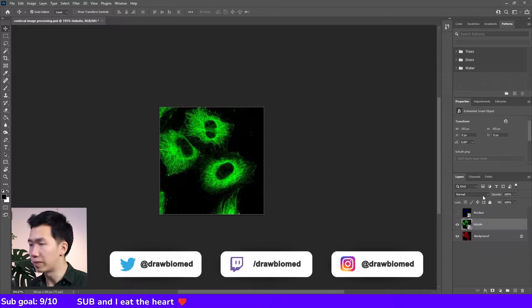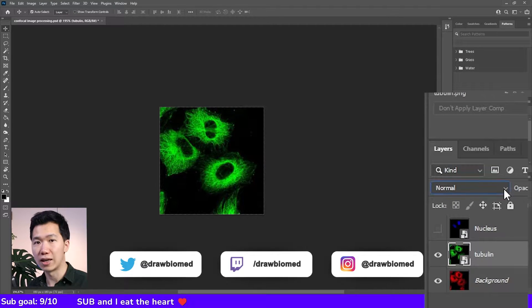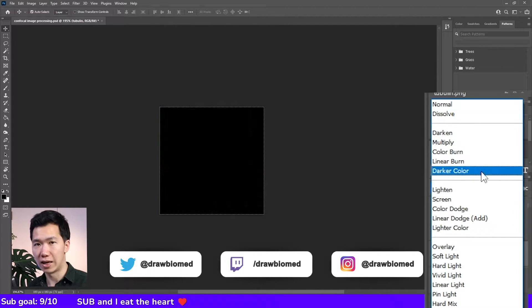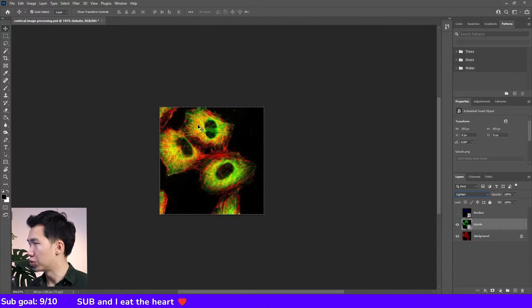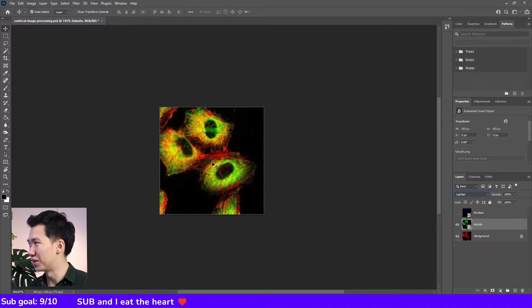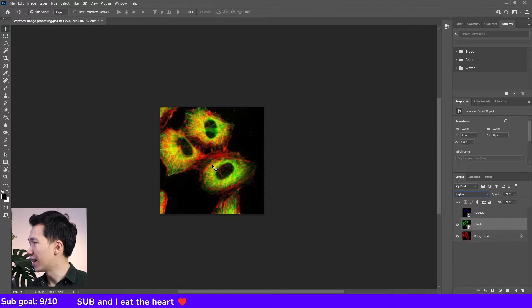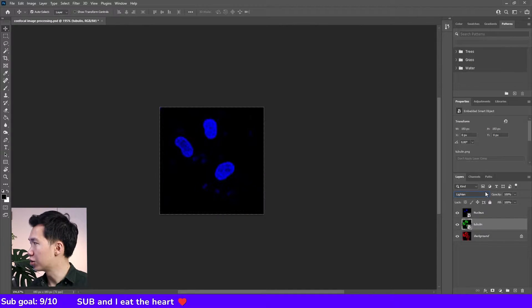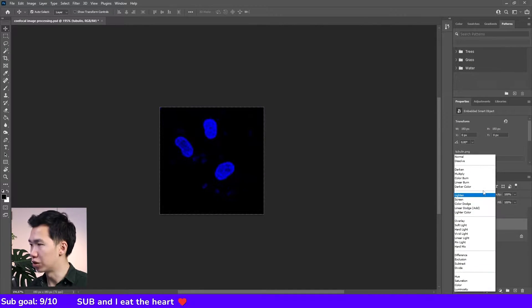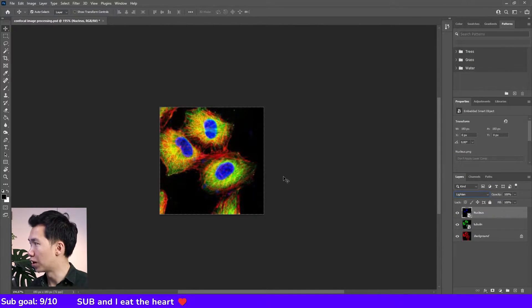Just simply go to this drop-down menu and click on lighten. Then you get to have this overlay image. This is so easy, isn't it? And you'll see the overlapping part has become yellow. Let's do it to the nucleus as well.